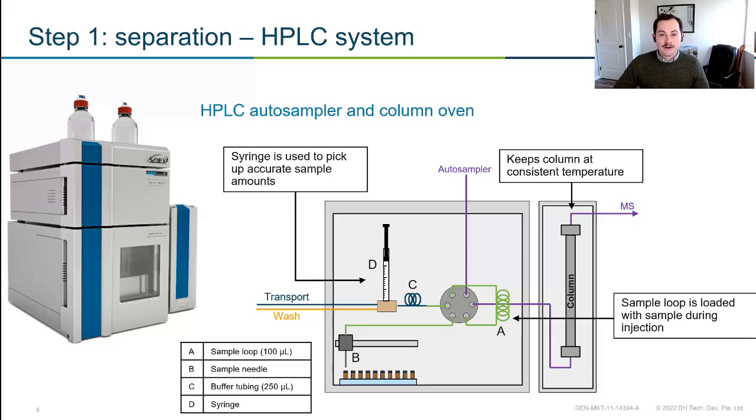And just like any other autosampler, this is really just saving us time, right? I know when I first started doing analytical chemistry for my master's, there was an instrument I needed to use and we didn't have an autosampler. So I had the luxury of sitting there with a stopwatch and every 20 minutes injecting a sample. So it's come a long way and it's great that it has.